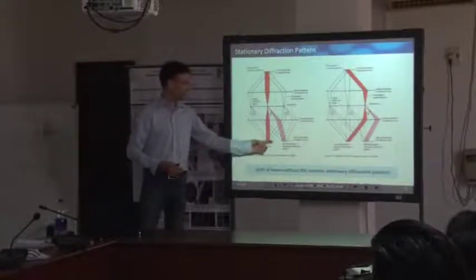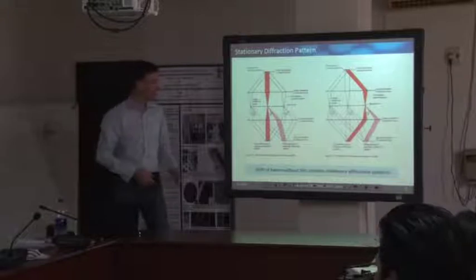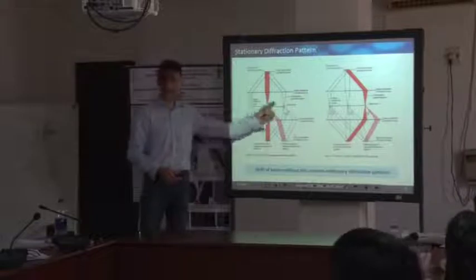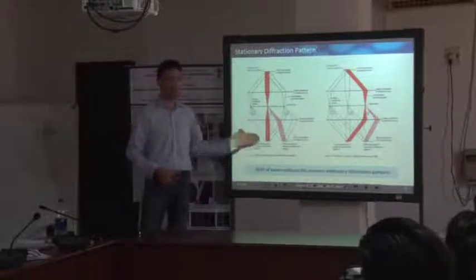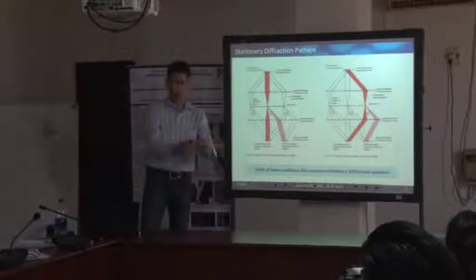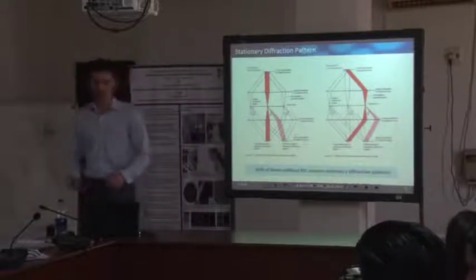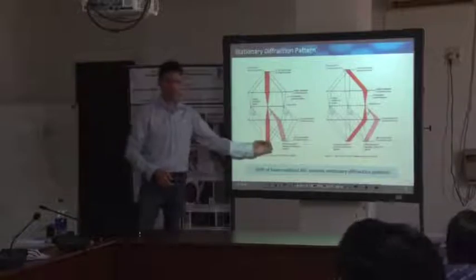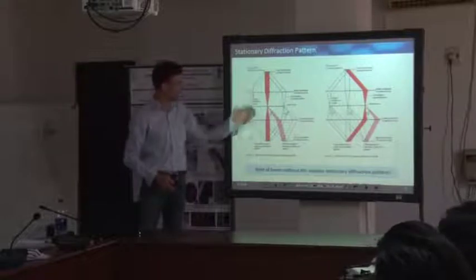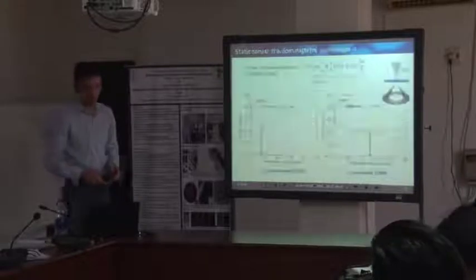Otherwise, this diffraction pattern would slightly move. This is what you will see at the transmission electron microscope that we have available here, so the diffraction pattern slightly moves. At low magnification for large scan fields, it moves quite far, and it might even hit our dark field detector, meaning that our central direct beam might hit our detector as it moves, which is not very good. We want to have a static diffraction pattern down here while we are scanning there. So this is why you need a symmetrical arrangement, or I would say it's beneficial to have that.